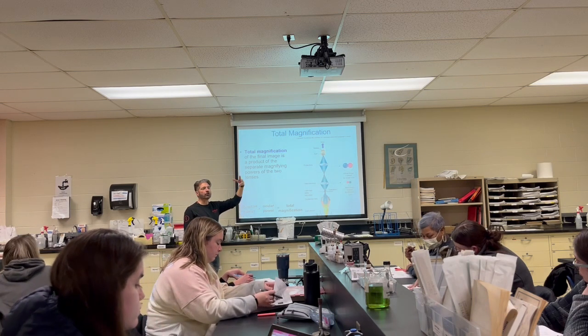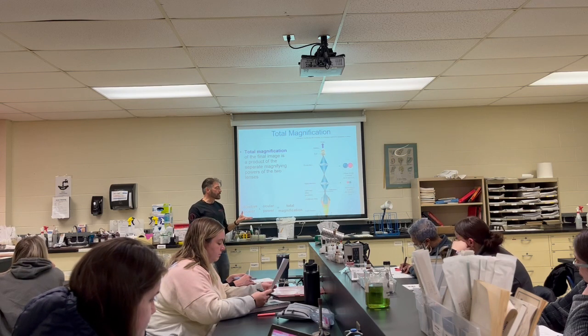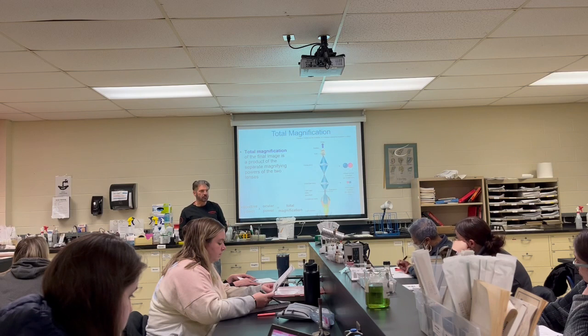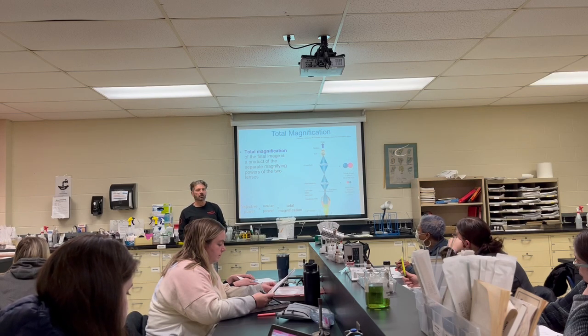So if I come over to you and say, Dr. Phil, I can't find this image, it won't come in, the bacteria won't behave, it won't stay still, or I can't find it, I'm going to say, what magnification are you on? And if you're on oil immersion and you didn't bring it into focus prior to that, well, good luck. So I'll go over the steps and how you do it.